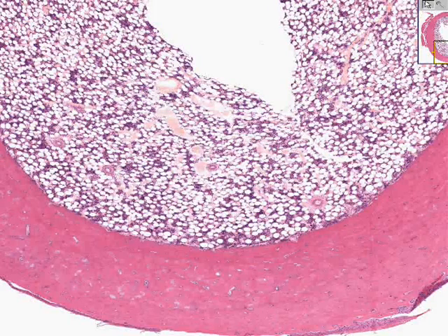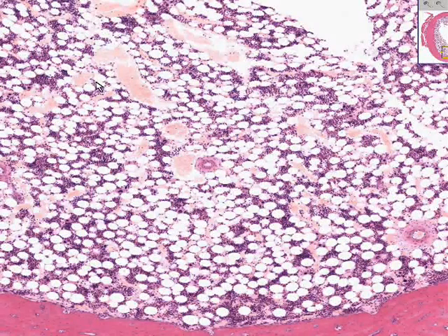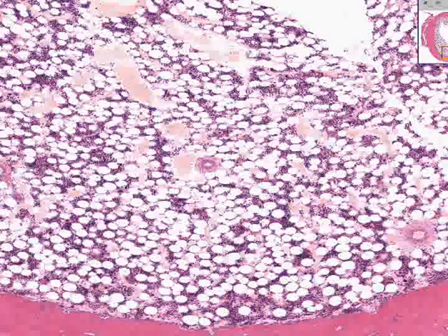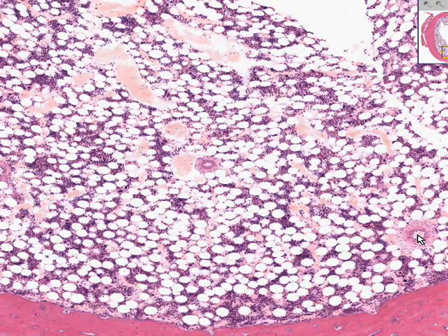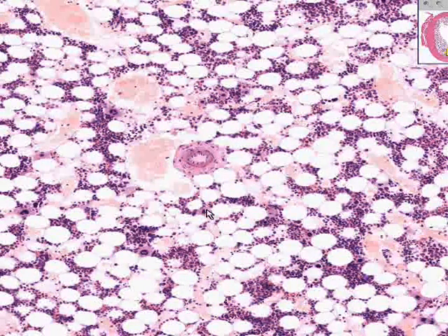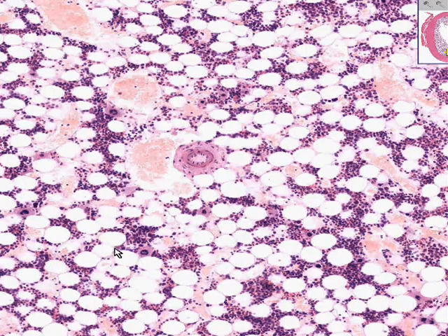Let's take a couple of clicks in here, and I think let's look at the marrow first. You can appreciate that approximately half of this cross-sectional area is washed out fat spaces or adipose tissue. You could see 1, 2, 3 arteries at least. You could see veins or venous spaces or sinusoids here, and here, and here, and here, and here. So we see fat, we see arteries, we see veins, and in addition, we see the cellular component of hematopoietic bone marrow, which are cells.